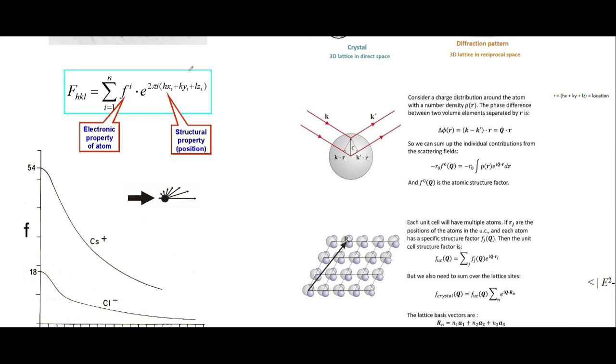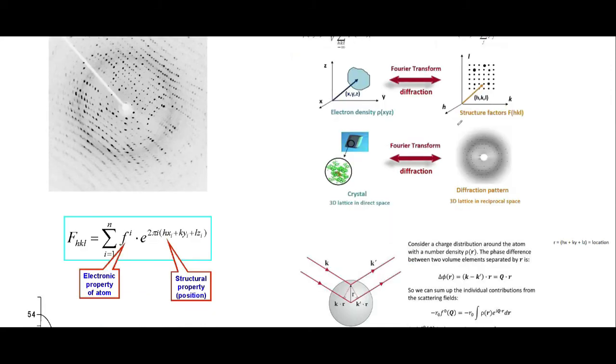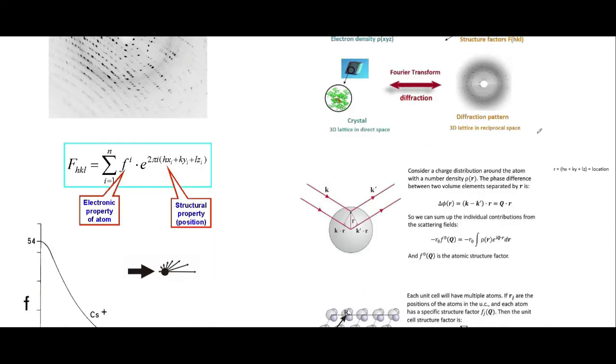So what we have up here is our structure factors, and the structure factors we can obtain from the atomic structure factor plus the positions.